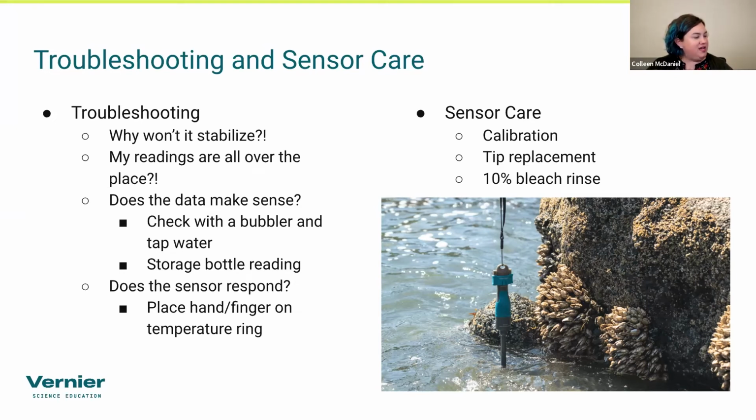Matt asks, can that be seen in the graphical analysis data table graph plateau? I'm assuming you're talking about the stabilization readings. What will happen is as the graph goes up, it does reach that plateau and goes around like this a little bit. But you definitely can see that it will plateau and level out.